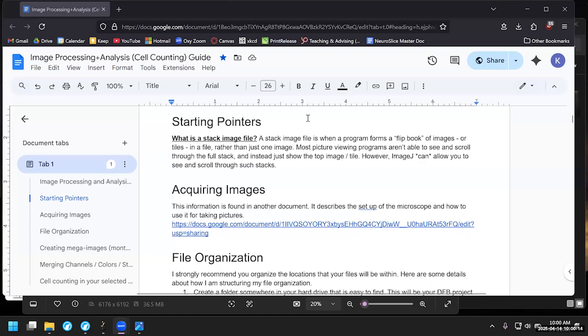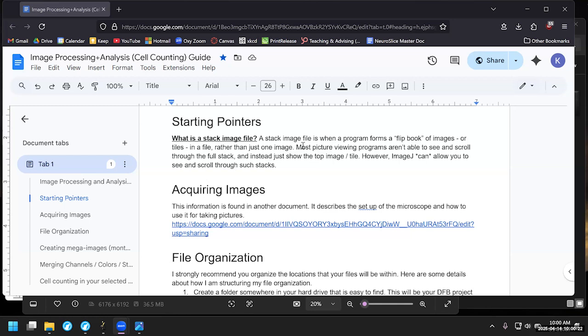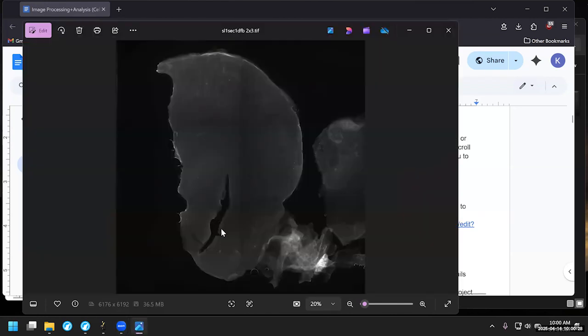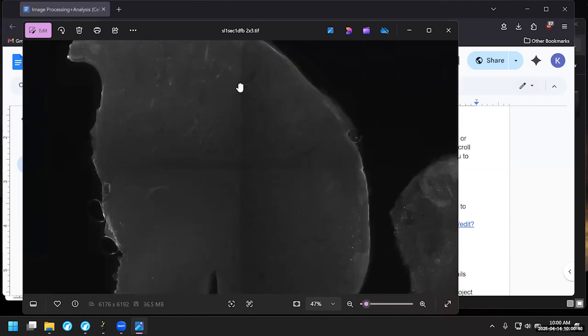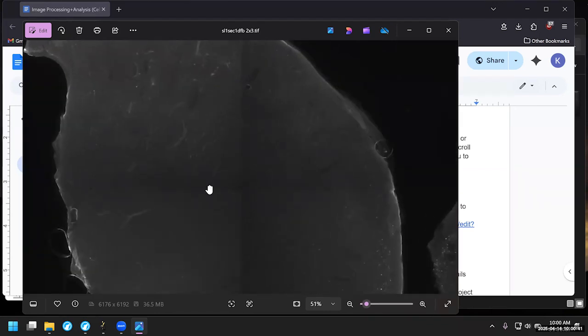Howdy, fellow denizens of the internet. I want to do a brief video on how to take image stack files, split them into their component tiles, and then reconstruct them into a larger image. For an illustration of what I'm talking about, here is an example image that some people might refer to as a mosaic or some sort of tiled image. And in this one, you can actually see the borders of where the individual images used to be.